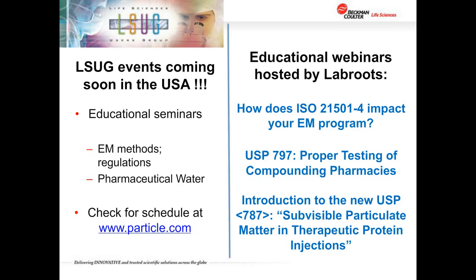Okay. Next, we have a question from Jeff, who asks, the prior version of ISO 14644-2 required reclassification of ISO Class 5 to be done every 6 months. That table in Table 2 has been removed. Is that still the expectation for pharmaceuticals, ISO 5 every 6 months, or would 12 months now be followed based on Section 5 of the current version of ISO 14644-2? Well, without knowing anything further about what's being done in the room, you would say, I can go to 12 months.